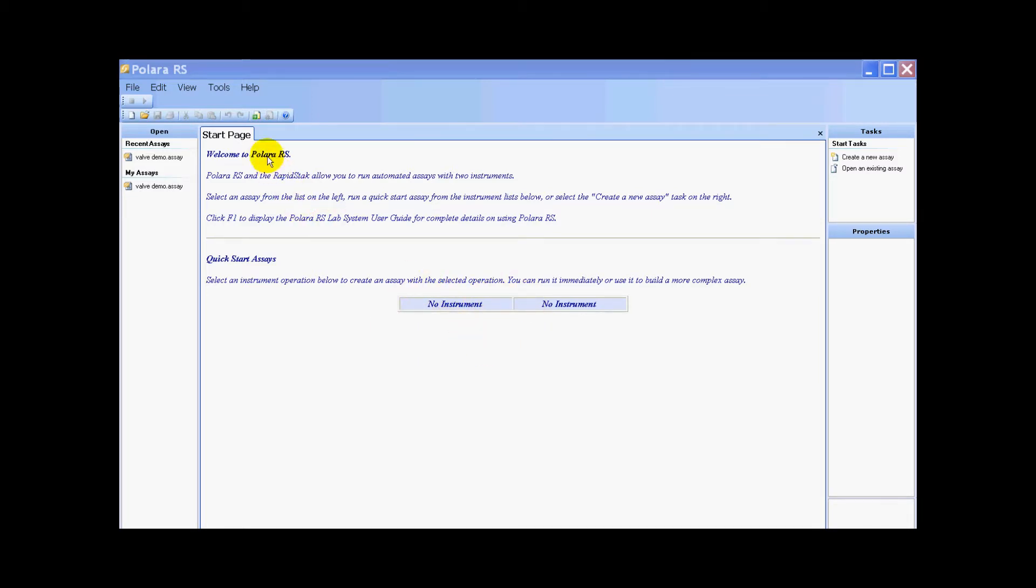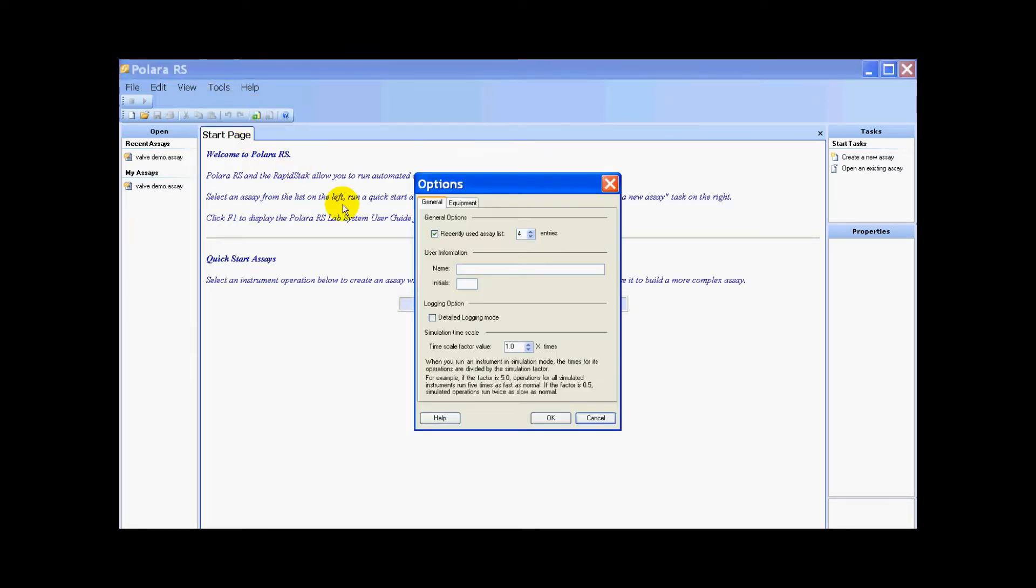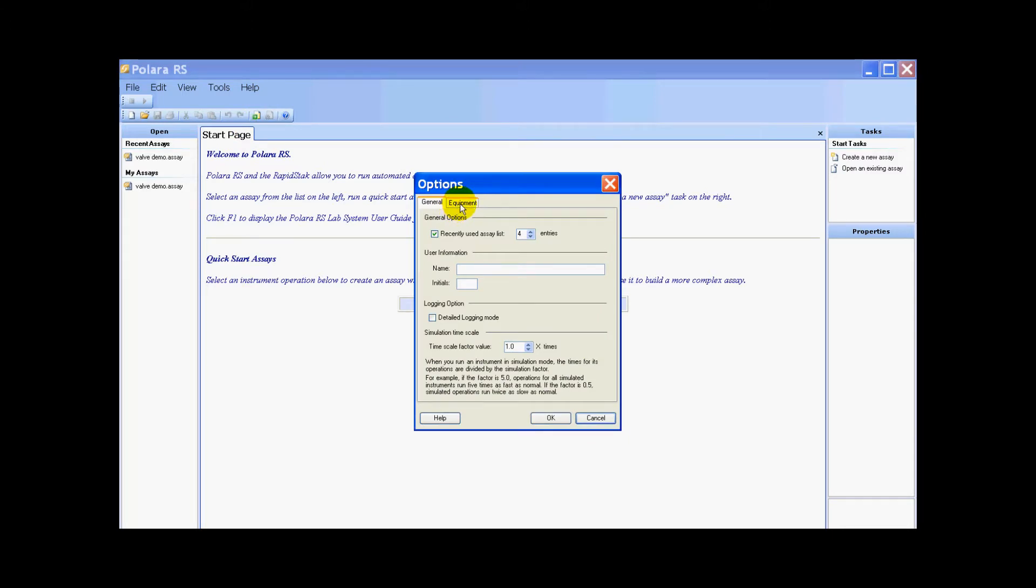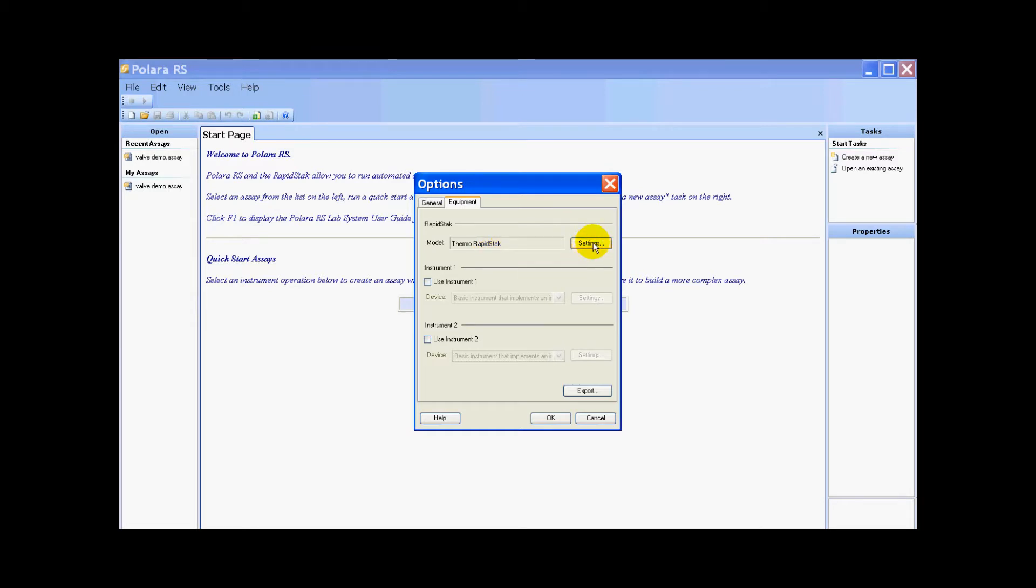To do this, we go to Tools, Options, and then under the options pop-up we go to the Equipment tab. On the Equipment tab we need to set up our instruments including the rapid stack, which might seem odd at first, but bear with me.